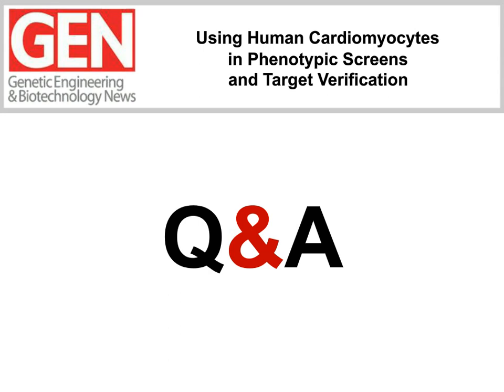Okay, let's go back to Anne. Someone says, very interesting work. Why are you using BNP instead of ANP as a hypertrophic marker?